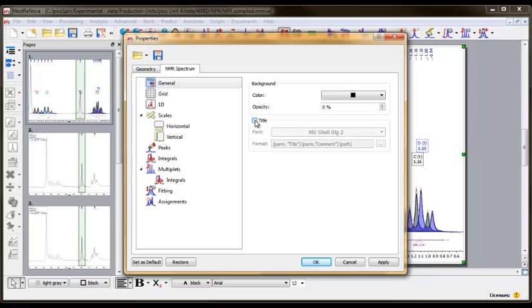I find this brings no additional value to the information being displayed on the spectrum, and often interferes with many of the other text adornments I usually add to the spectrum. And since you can't interactively reposition the file path text, I hide this information from the spectrum view, but make it available when I hover the mouse over the spectrum in the pages workspace.